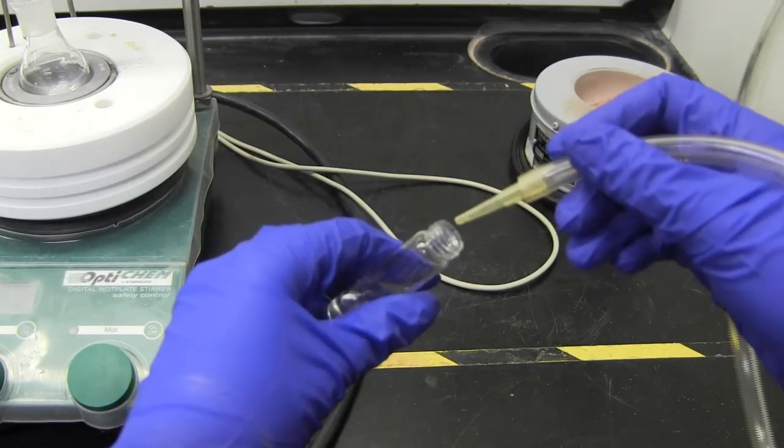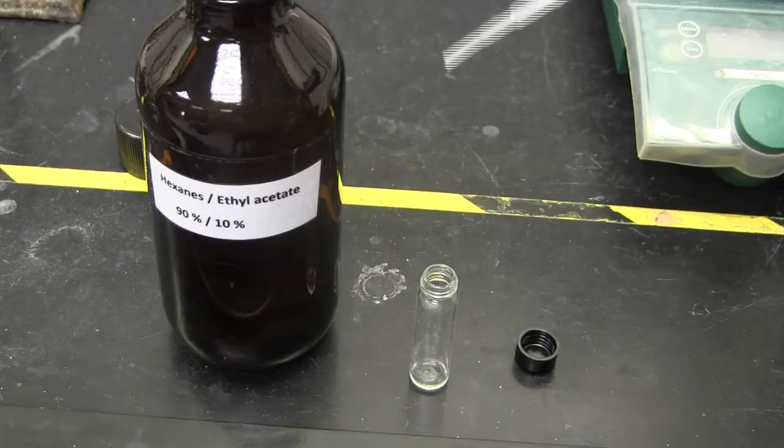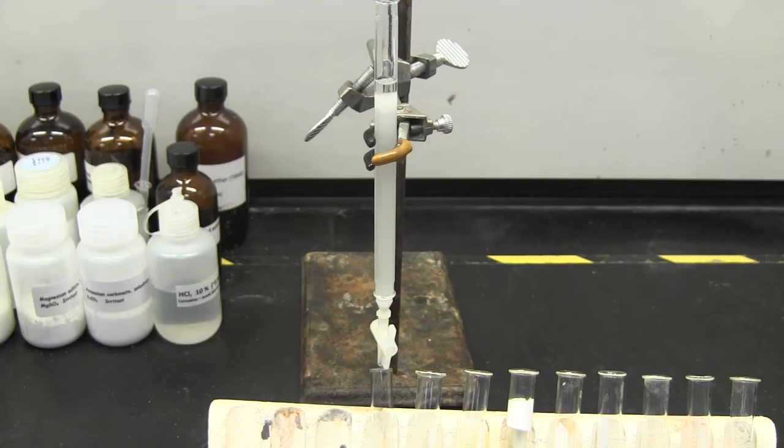To prepare this column, look back on the silica gel column chromatography lab. Next, dissolve your oil. This should take about two drops of solvent. Drain your column so the solvent is at the top of the gel.